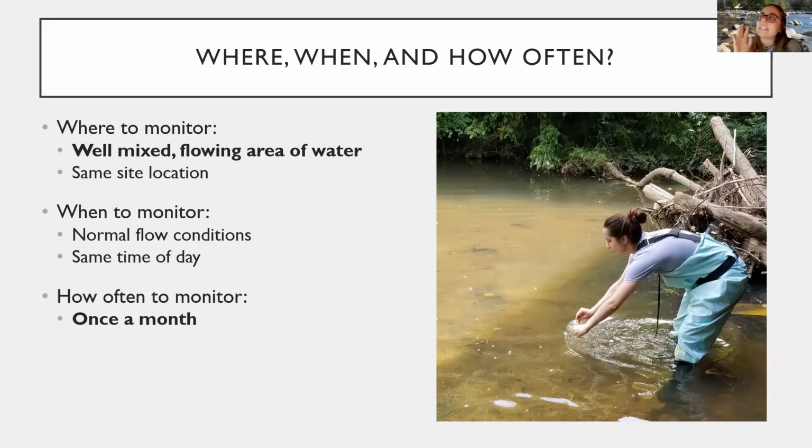So if you're interested in adopting this bacterial routine into your AdoptAStream monitoring, this is something that we recommend is done once a month. You're a volunteer, so we appreciate any time that you contribute to our program. It can be more or less, completely up to you, but we do recommend once a month for this sampling type. Now I'm going to hand it over to Jackie so she can talk us through these steps.